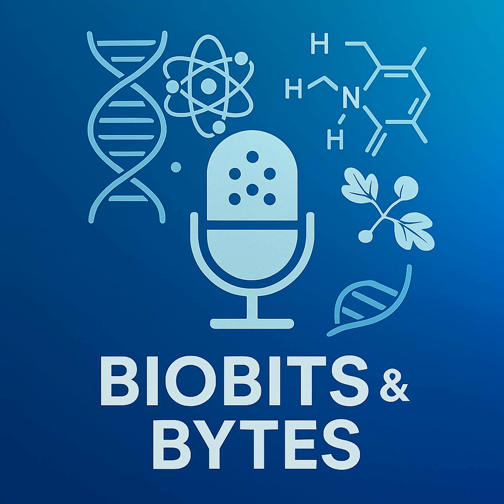Exactly. And for eukaryotes, organisms like us, mRNA often has a specific tail, a poly-A tail. So you can use a neat trick with tiny DNA pieces called oligo-dT that stick to that tail and basically fish out the mRNA from the total RNA pool. Clever. Okay, so you've got your RNA, maybe mostly mRNA, then separate by size again. Yep, separate by size using gel electrophoresis.